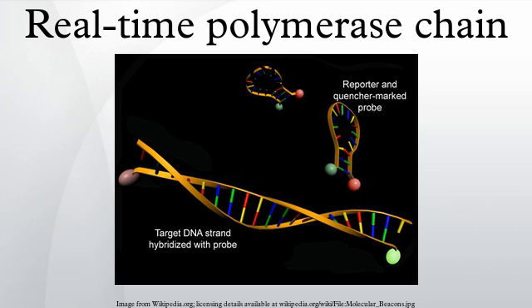The PCR is prepared as usual, and the reporter probe is added. As the reaction commences, during the annealing stage of the PCR both probe and primers anneal to the DNA target. Polymerization of a new DNA strand is initiated from the primers, and once the polymerase reaches the probe, its 5' to 3' exonuclease degrades the probe, physically separating the fluorescent reporter from the quencher, resulting in an increase in fluorescence. Fluorescence is detected and measured in a real-time PCR machine, and its geometric increase corresponding to exponential increase of the product is used to determine the quantification cycle in each reaction.